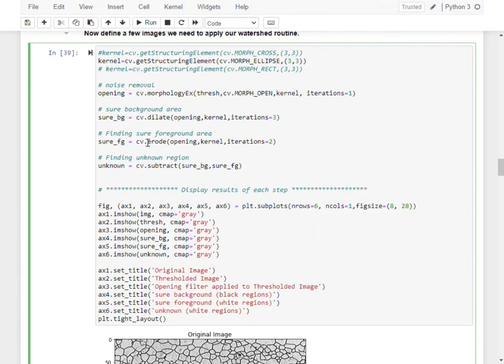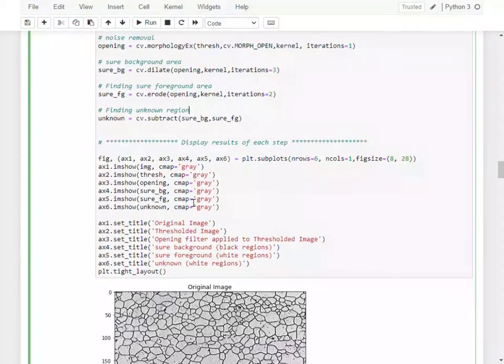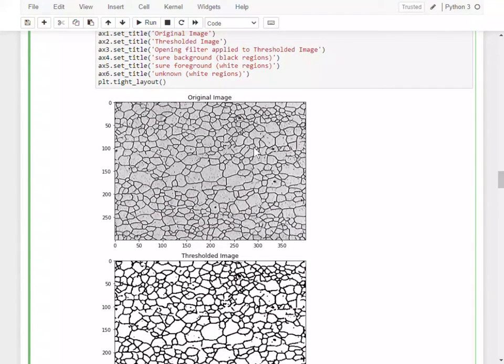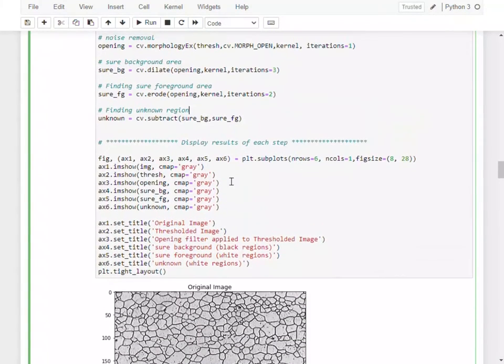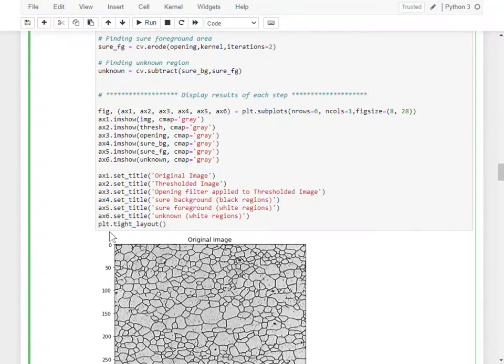Okay. Typical examples, if you look this up on the web, you'll find people using it for a collection of coins that are sitting on a surface, and they use this to identify the coins from the table surface, and the table in that case would be your background that you want to ignore. Okay, but again, we don't really have a background because the entire image is what we want to try and analyze.